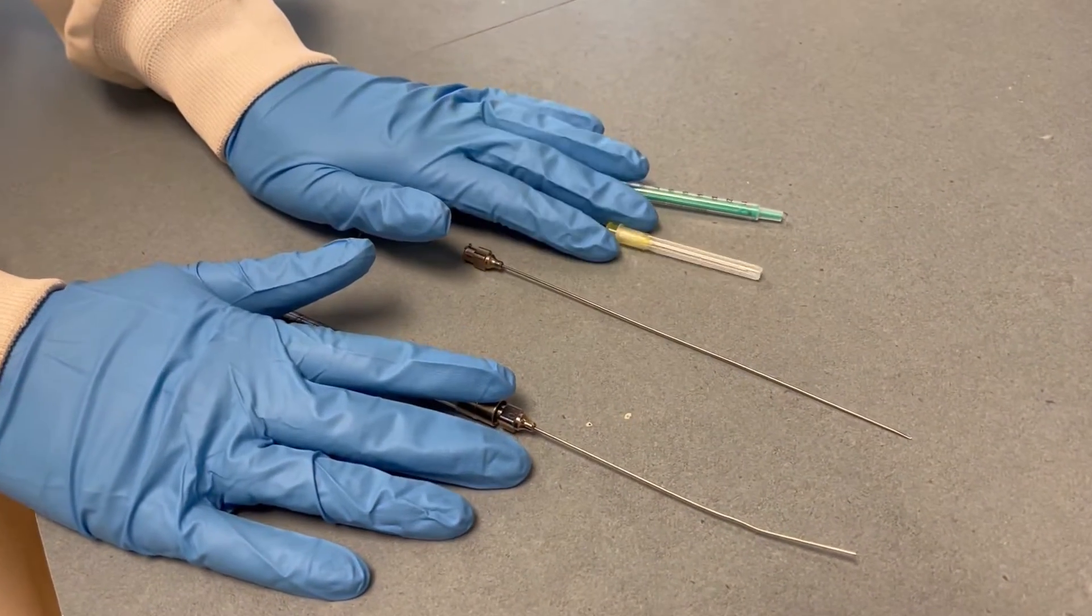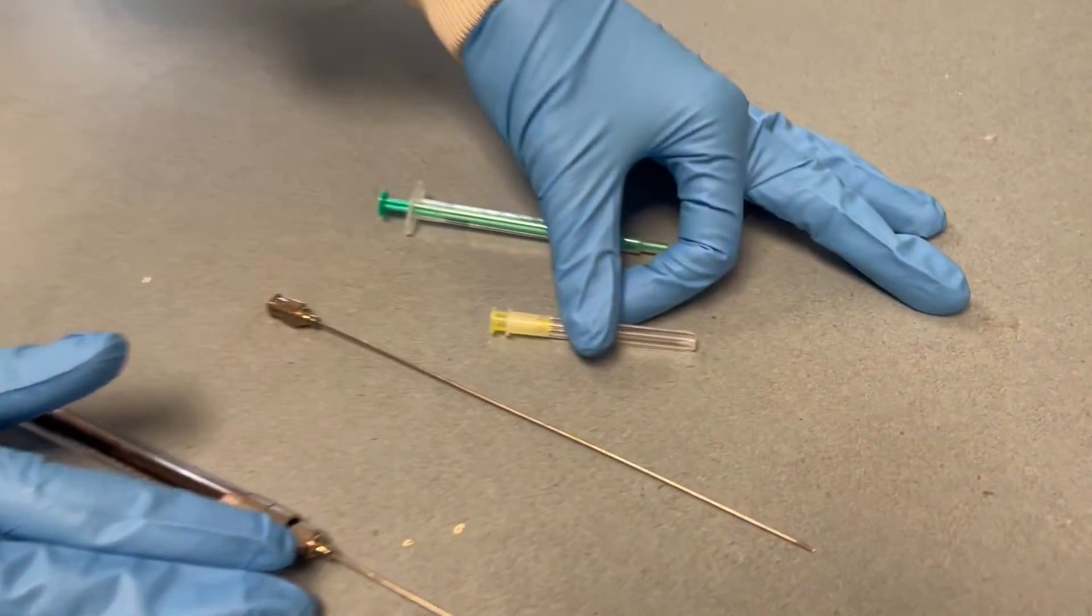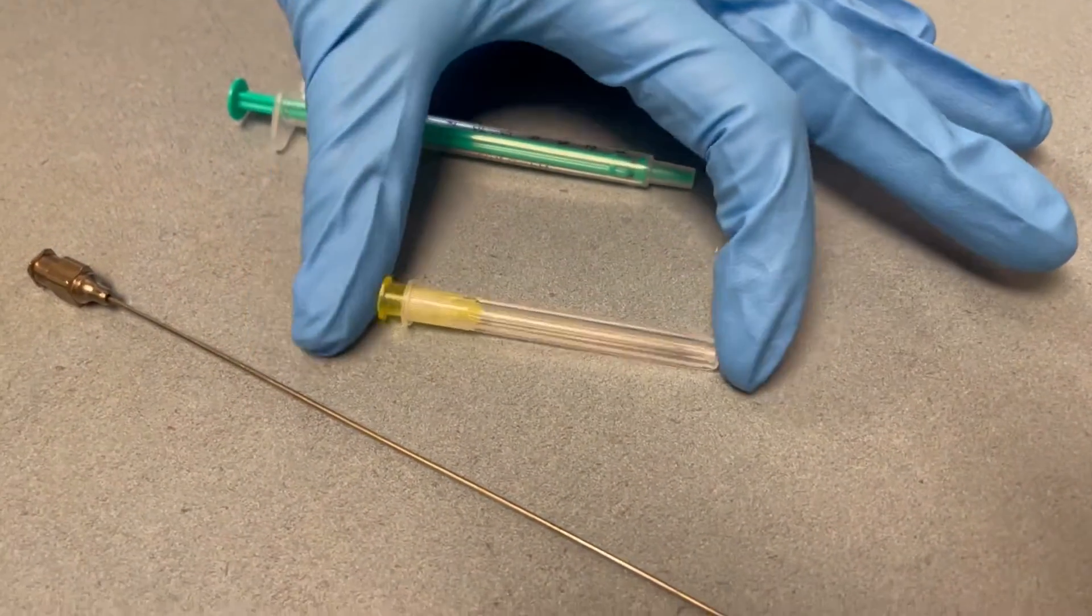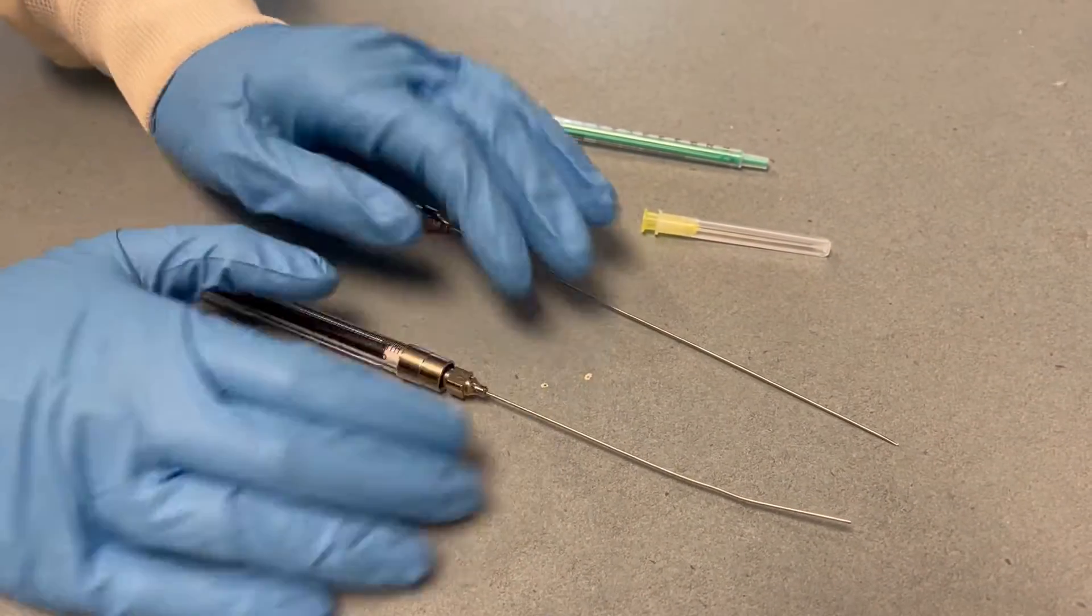Disposable needles are convenient since they're always clean and sharp, but since they're polypropylene they can't be heated in the oven and we can't ensure that they're always moisture free. So we have stainless steel needles that can go in the oven.